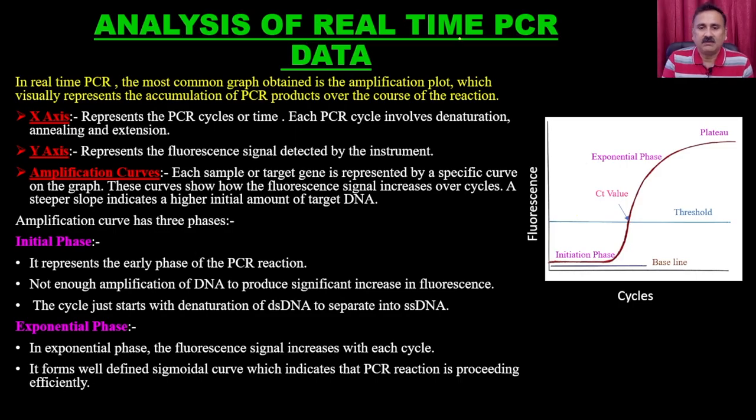So, analysis of real-time PCR. In real-time PCR, the most common graph method is the amplification plot, which usually represents the accumulation of PCR product over the course of the reaction. So, this is what you are going to get.